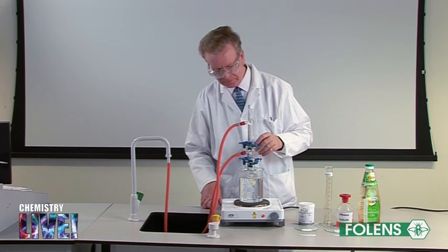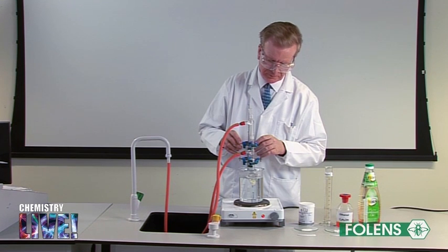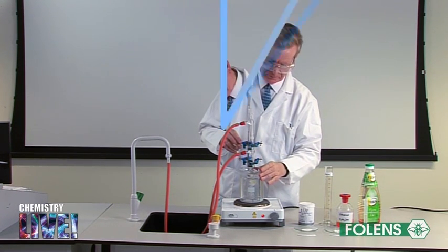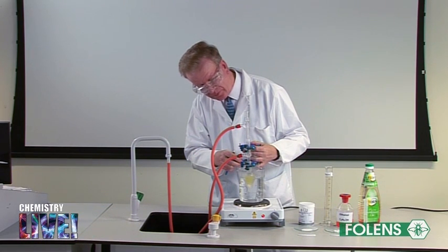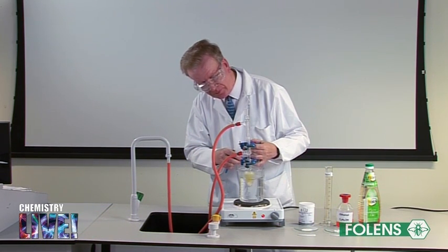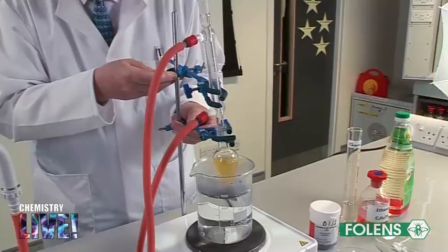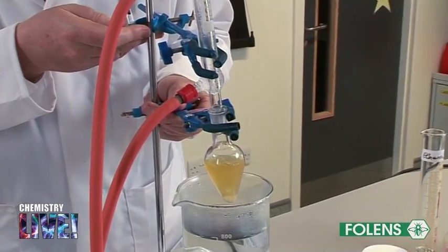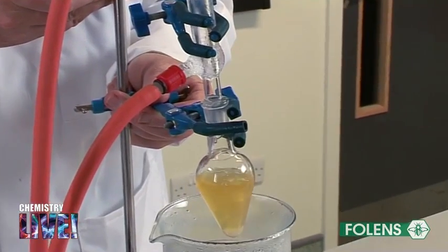Heat the mixture over a water bath for about 30 minutes. If we lift the flask out of the boiling water for a moment, we can see the condensed ethanol falling back into the flask — that is, it is refluxing.